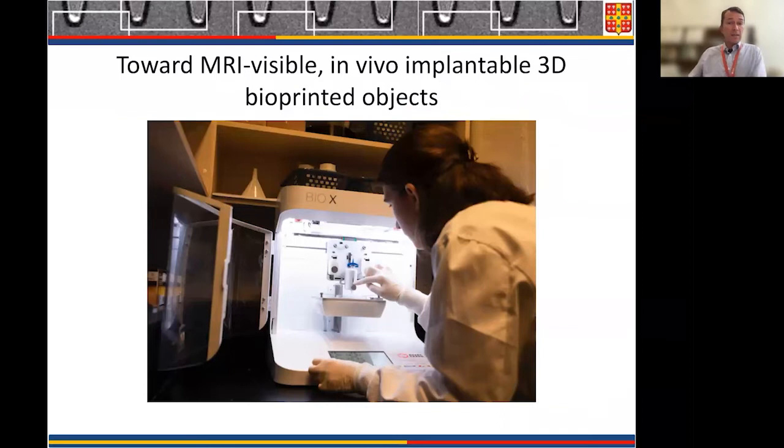So next step, more 3D printing, and we mainly perform our proof of concepts with a BioX printer. It is not a printer that allows ultra high resolution printing, but for proof of concepts of what we are doing in contrast enhancement studies, it is a very good multimodality tool.